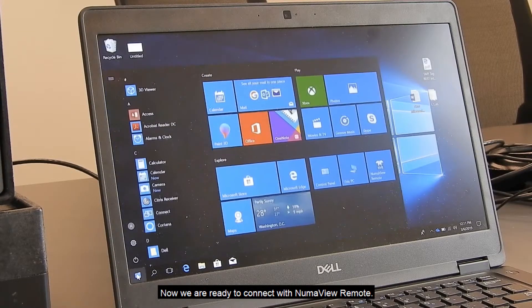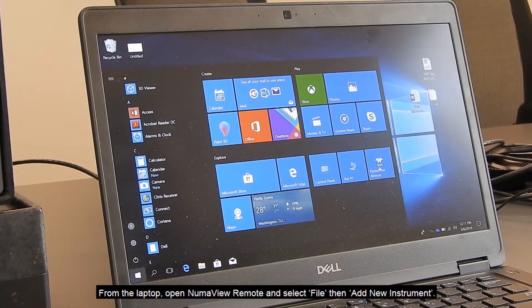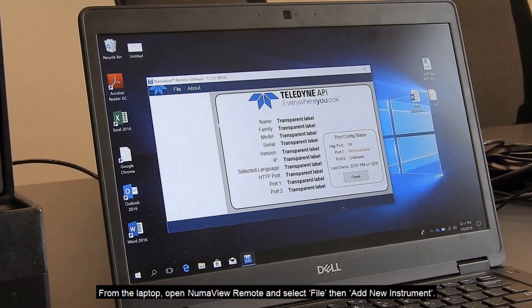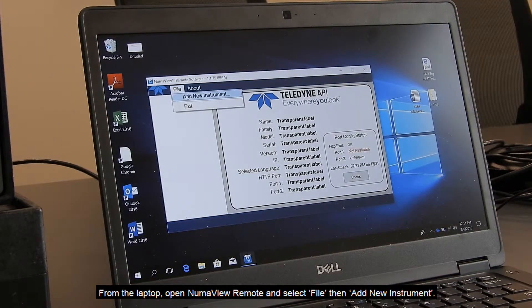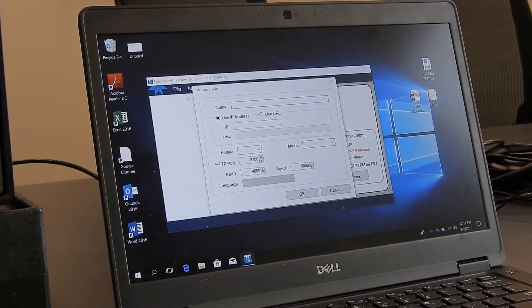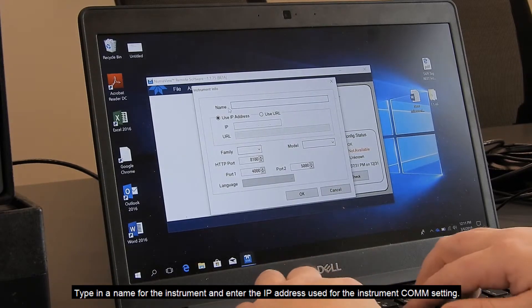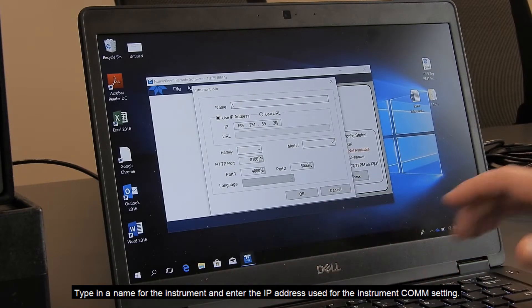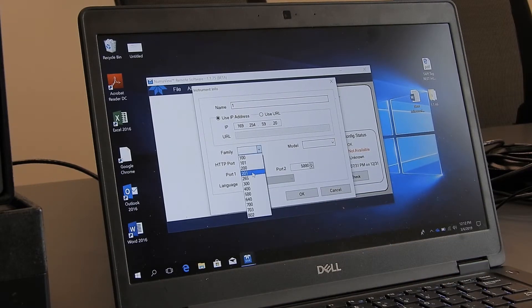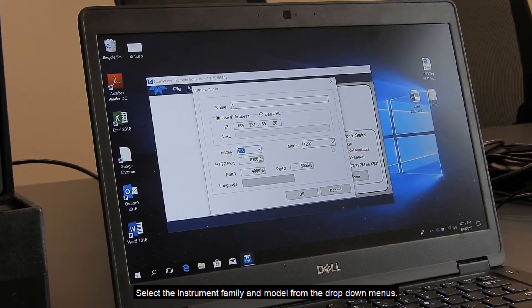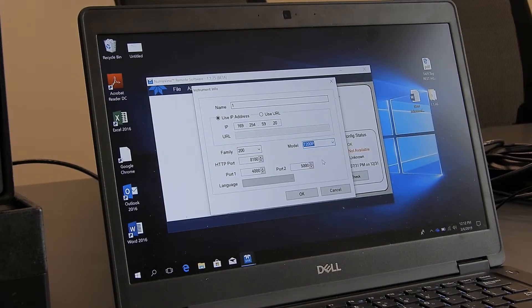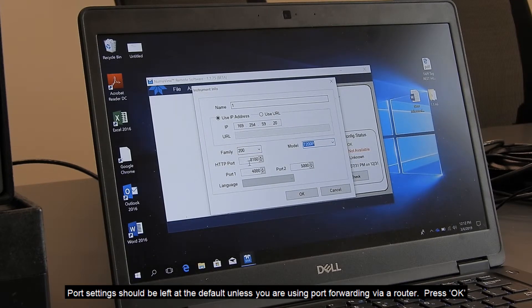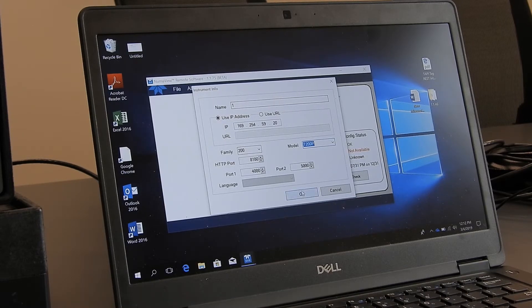Now we are ready to connect with Numaview Remote. From the laptop, open Numaview Remote and select File, then Add New Instrument. Type in a name for the instrument and enter the IP address used for the instrument comm setting. Select the instrument family and model from the drop-down menus. Port settings should be left to the default unless you are using port forwarding via a router. Press OK.